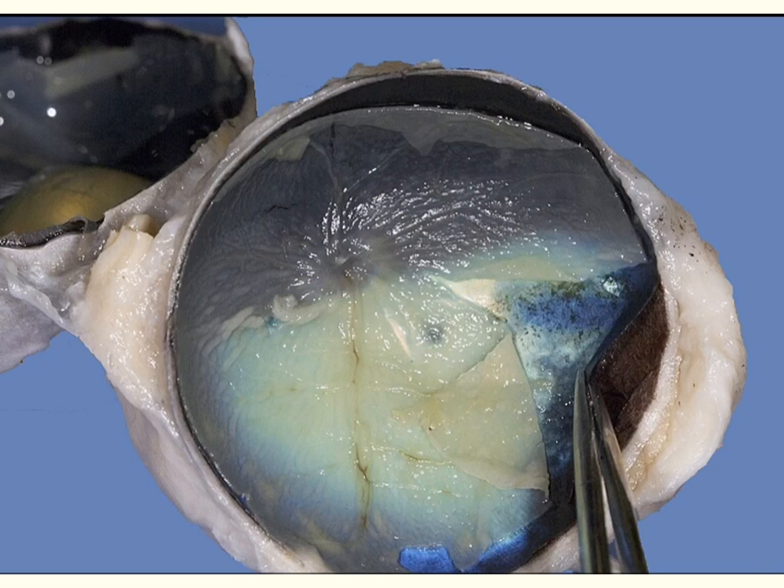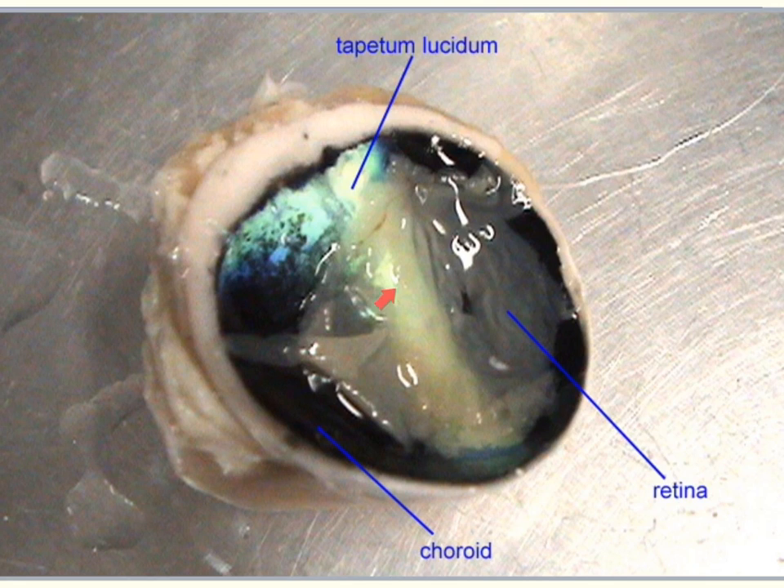Below the retina we have our highly vascularized layer known as the choroid. Moving the retina aside, we see this deep pigmented vascular layer — the choroid — which supplies nutrients to the interior portion of the eye. You'll also notice a pretty color embedded here, and that is called the tapetum lucidum. This layer is not present in humans but is present in many mammals.